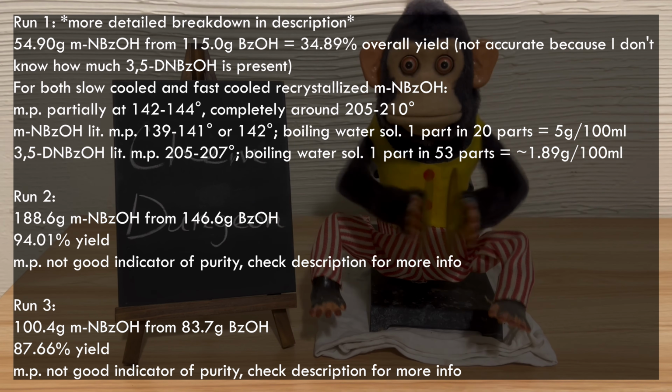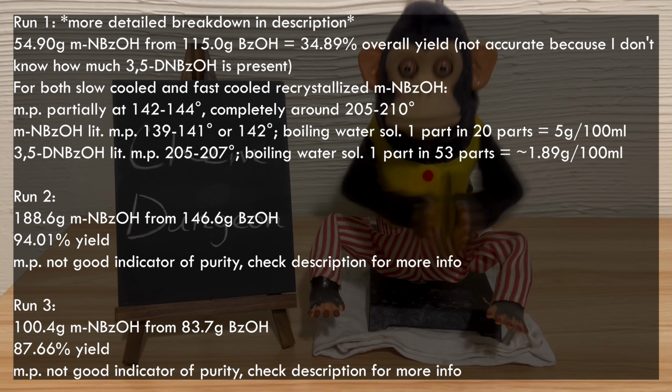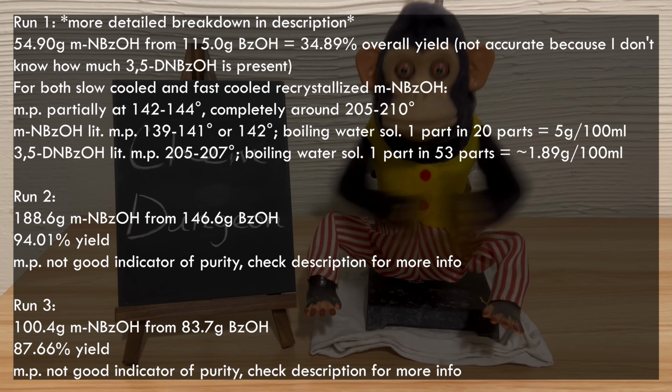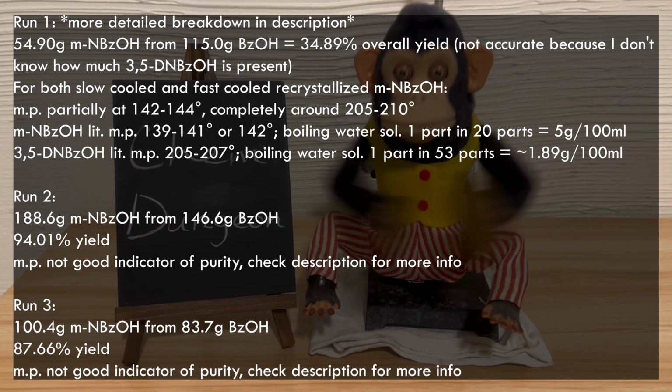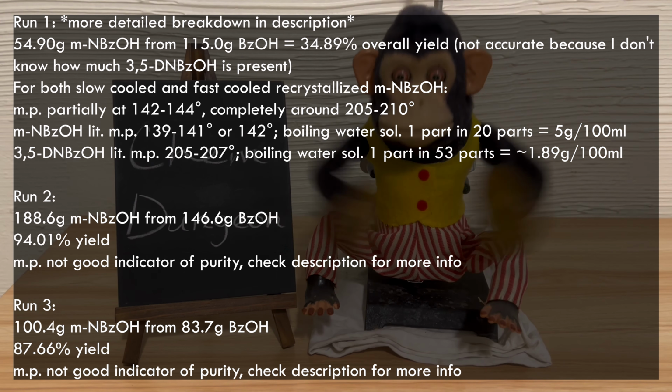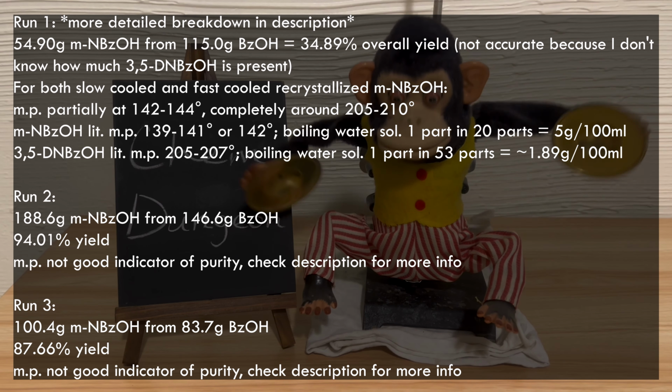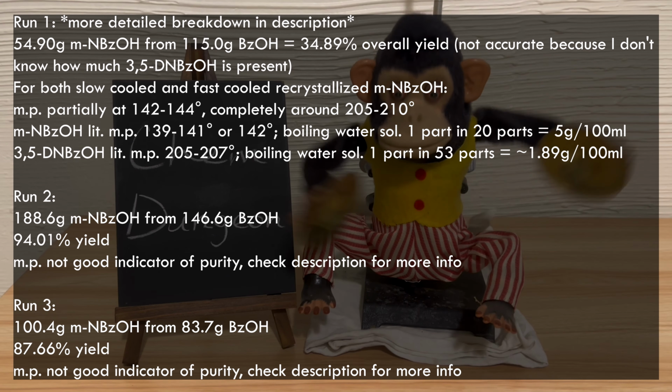I'm definitely going to just wait until my sodium metanitrobenzene sulfonate comes in the mail, instead of doing what I said in the intro, which was using the metanitrobenzoic acid in place of it for the dihydroquinacridone oxidation. I might use some of what I made in the second or third run for that, but I don't know yet. Still thinking about it. It does suck how the first run turned out, but oh well. That's chemistry, I guess.